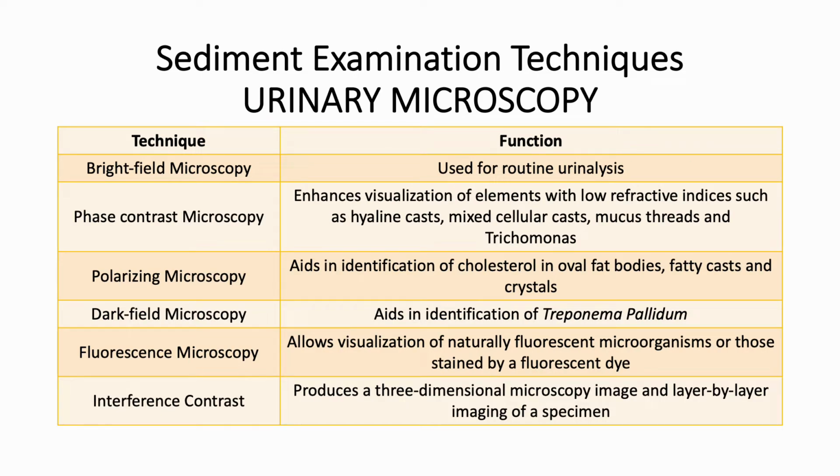Since there are many factors that can influence the appearance of urinary sediments, these include the cells and casts in varying stages of development and degeneration, distortion of the cells and crystals by the chemical content of the specimen, the presence of inclusions in cells and casts, and contamination by artifacts. Hence, identification can sometimes be very difficult.